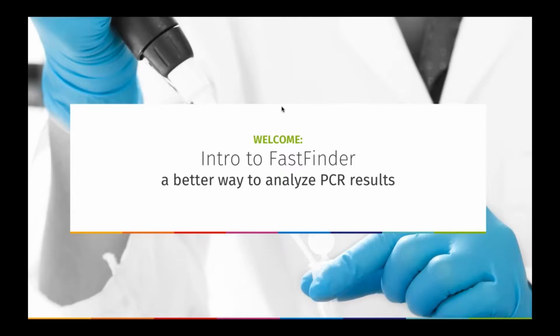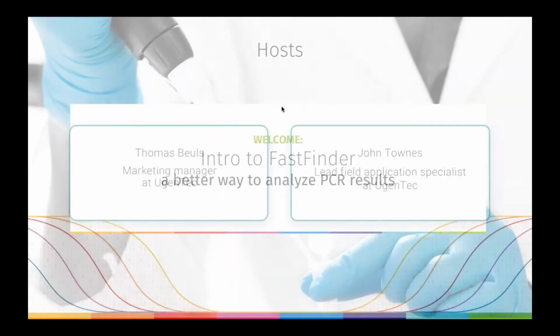We'll be talking about an introduction to FastFinder, which we like to call a better way to analyze PCR results.